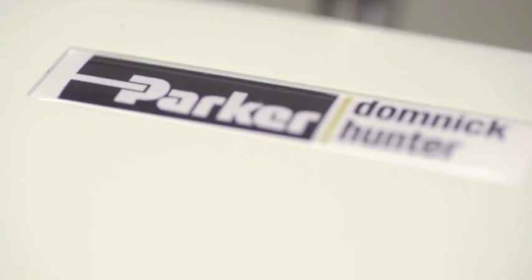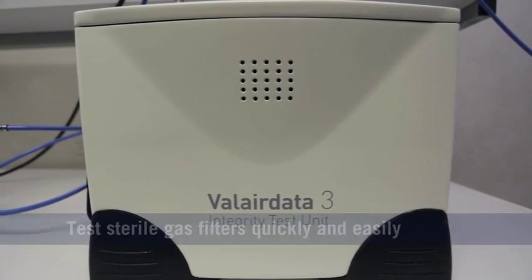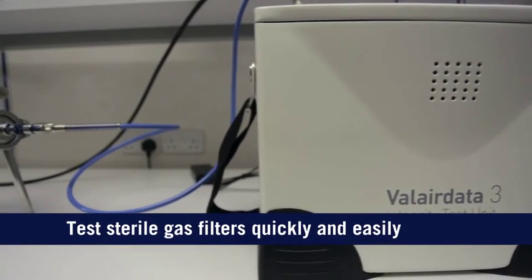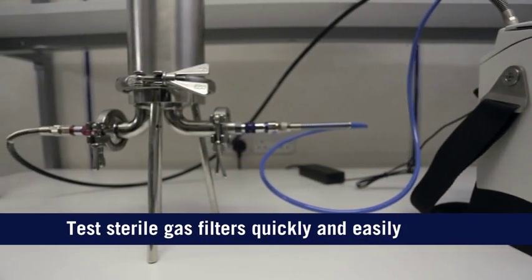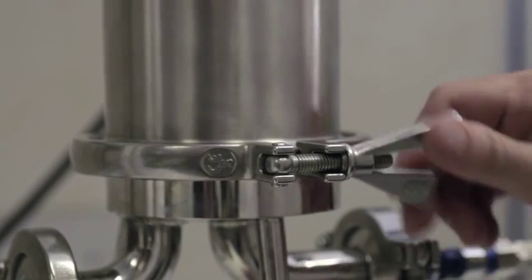The ValairData 3 has been developed by Parker Dominic Hunter and is designed to test the performance of sterile gas filters quickly and easily, ensuring the food production process can run without contamination from airborne sources.